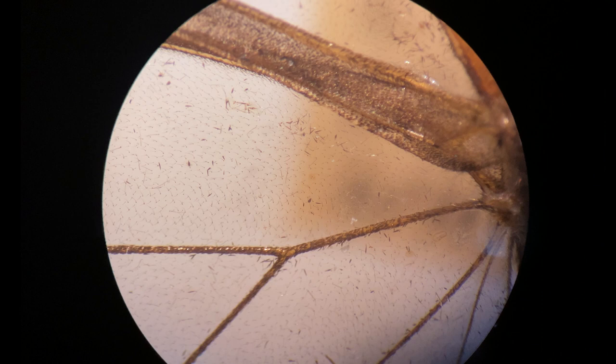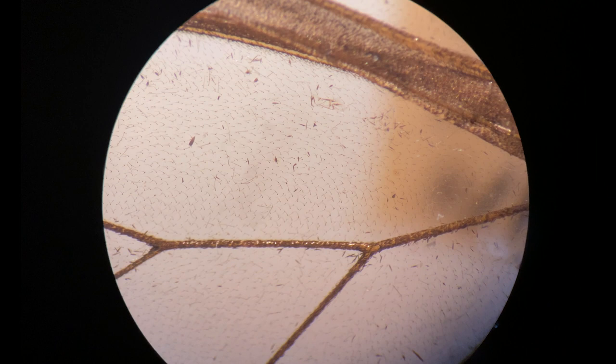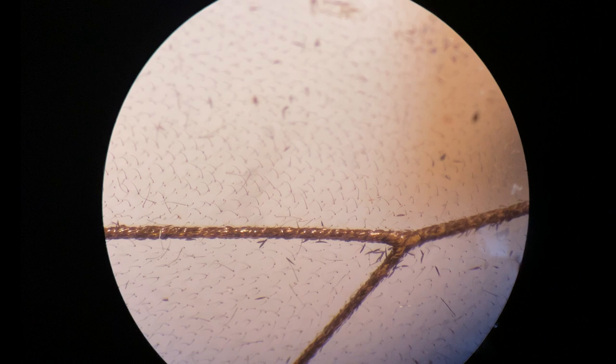Oh god. It looks hairy. So if you see it like on the veins kind of. I don't know exactly what they're called. But what might be the veins. They look like there's some small scales. But everything else kind of looks like a hairy leg or something like that. That's so odd.